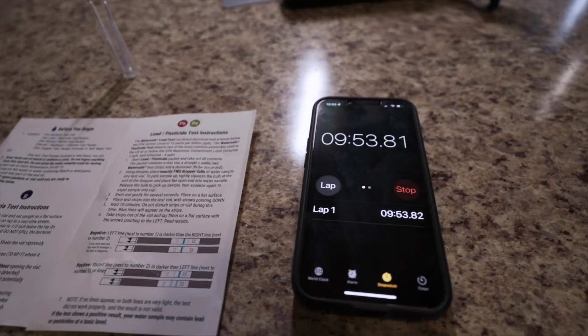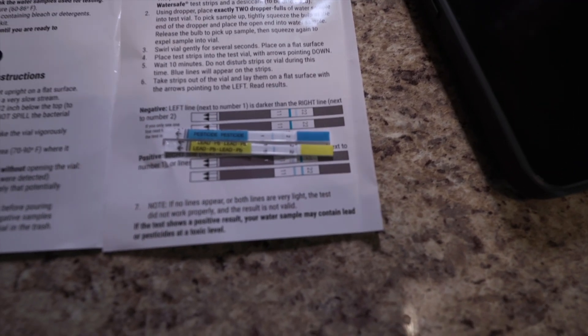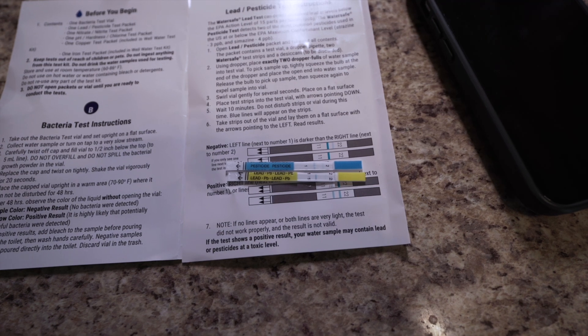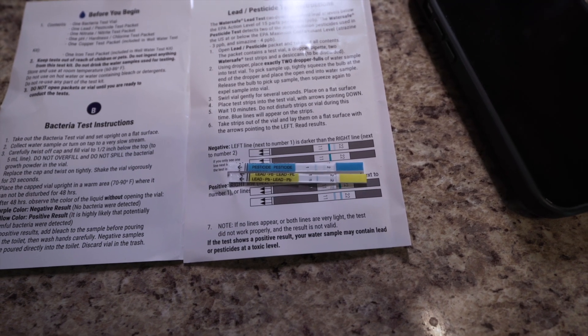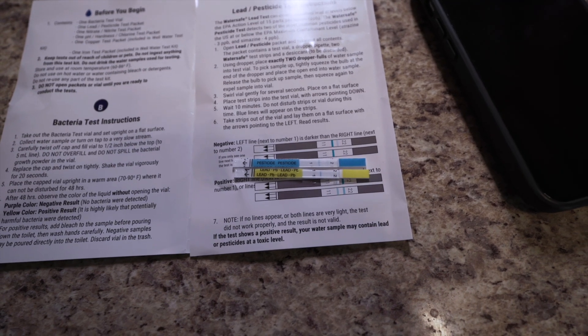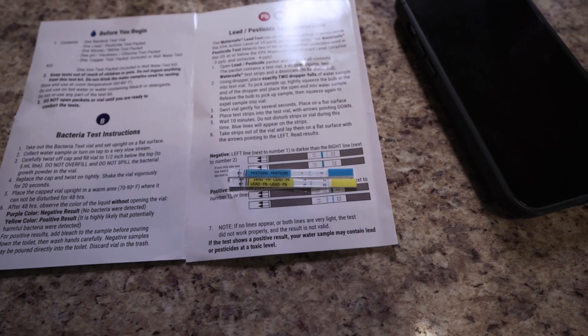Coming up on 10 minutes — we're going to pull them out and look for the blue line. If the blue line is closer to number one than number two, we're negative. We are negative for the two most common contaminants in farmland, which are atrazine and simazine.